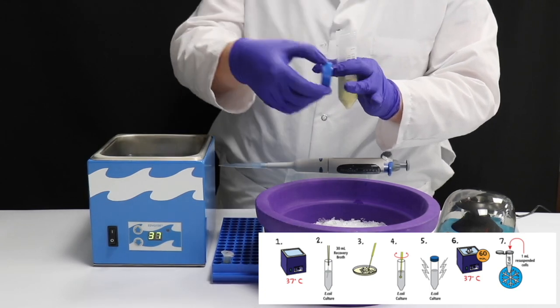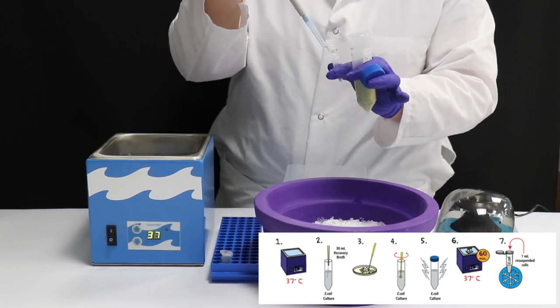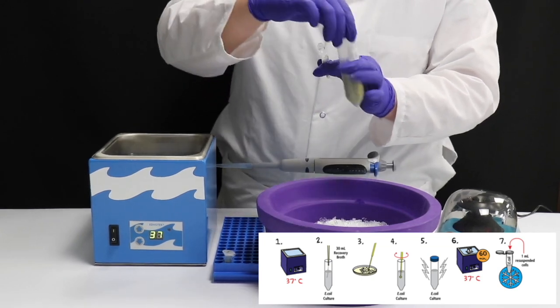Place these tubes on ice until they are needed for the experiment. These tubes can be stored up to 24 hours after aliquoting. Before storing, centrifuge tubes at max speed for 5 minutes and pour off the supernatant. Then store the cell pellet at 4 degrees Celsius.